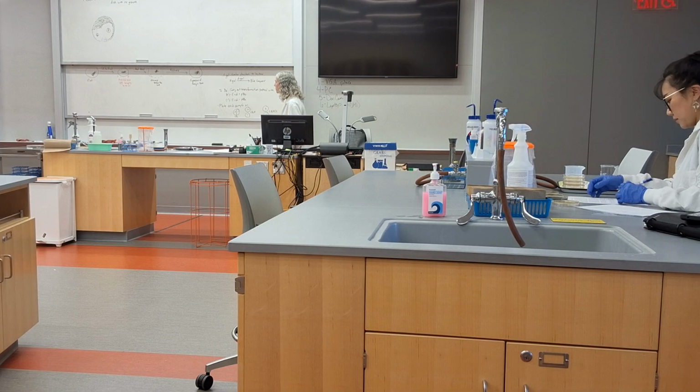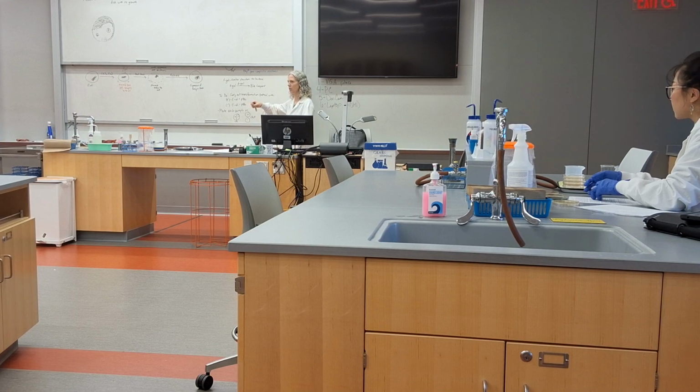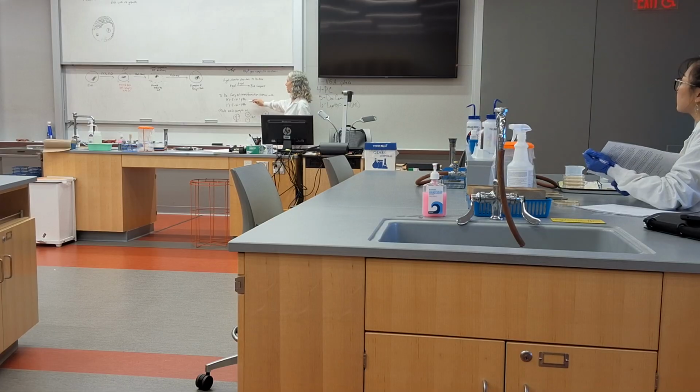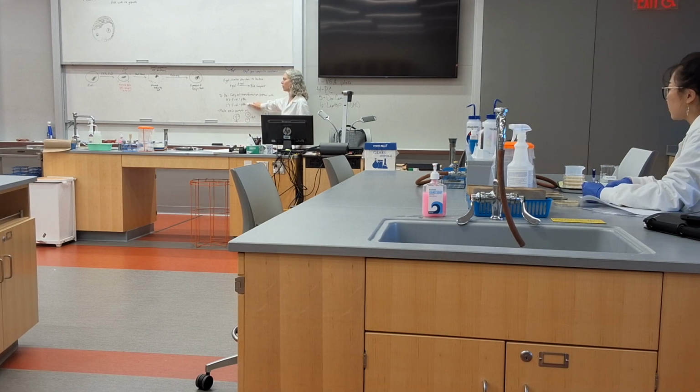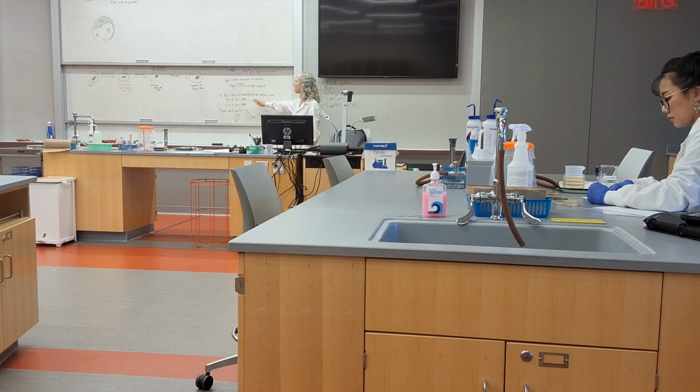colonies. So we are going to carry out transformation with two tubes. The one we're really hoping will be successful, E. coli with that P-Blue plasmid, carrying out heat shock, hoping it takes it up. But then we're also going to have a negative control, E. coli that we don't give the plasmid to. Because of course we want to make sure that this will give us a negative result, right? That with this negative sample, we don't also get blue colors. Okay. Any questions so far?